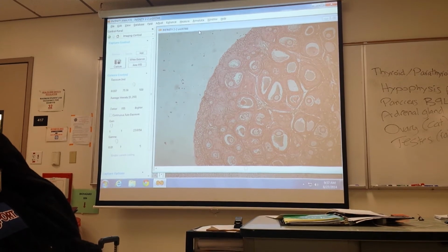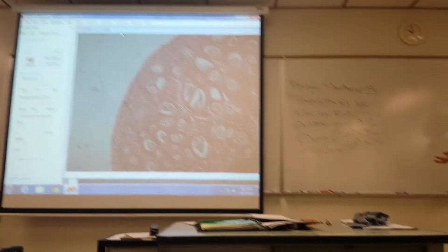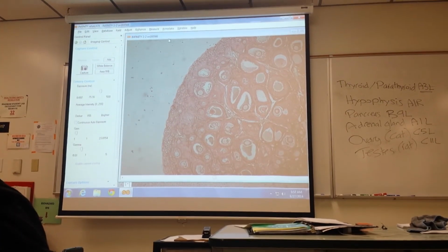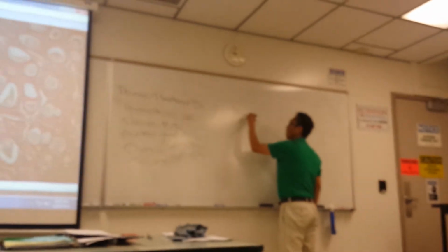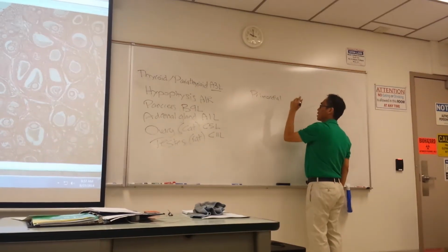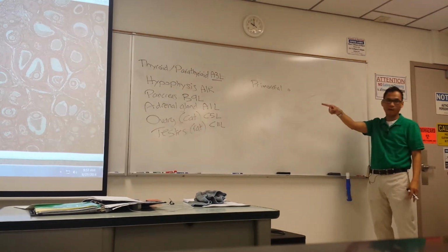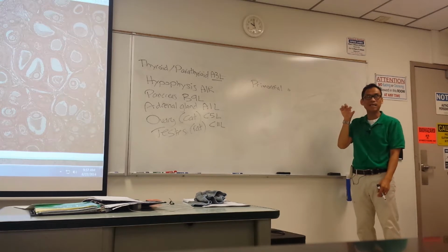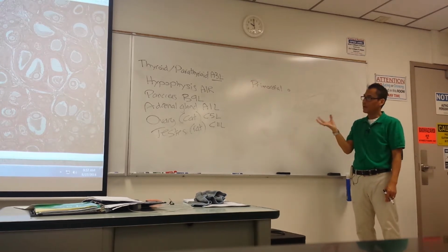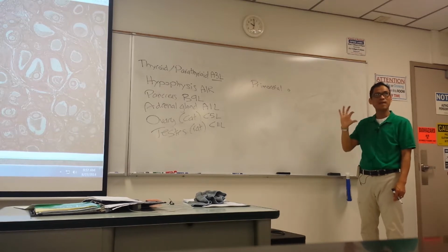But just for now, just to identify how do the follicles develop? Well, when you're born, you got maybe 1 million of them, but they're really small. They're called primordial follicles. Okay, so I'll draw a little circle. I'm not going to try to draw the details. I'm going to show you the real thing right here. They're small follicles with an egg inside, really small. And you want to look for them at the cortex of the ovary. They're at the edge.